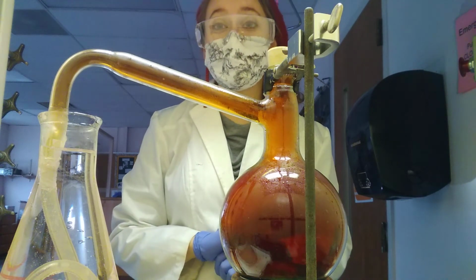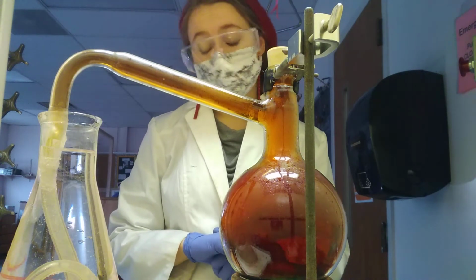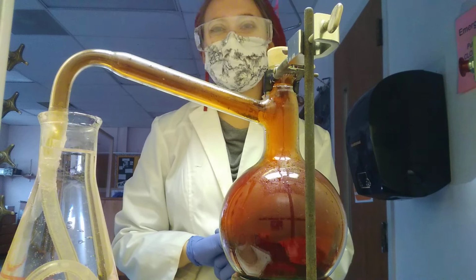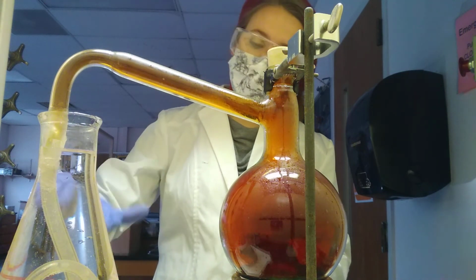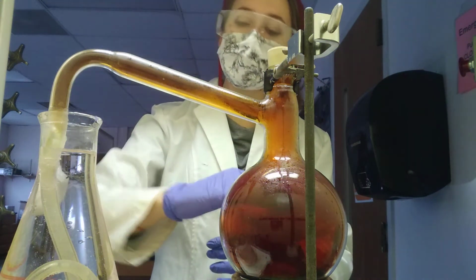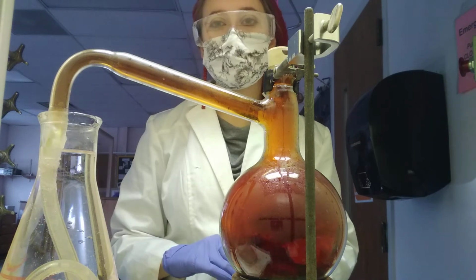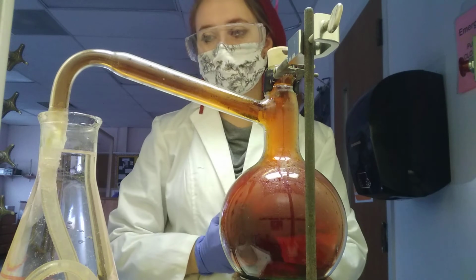There is a question that I would like you to email me sometime during class today, or actually sometime before tomorrow. Let's say that. If the water is pushing the NO2 back into its original flask, what do you think is pushing on the water? What is making the water push the NO2 back into the flask?